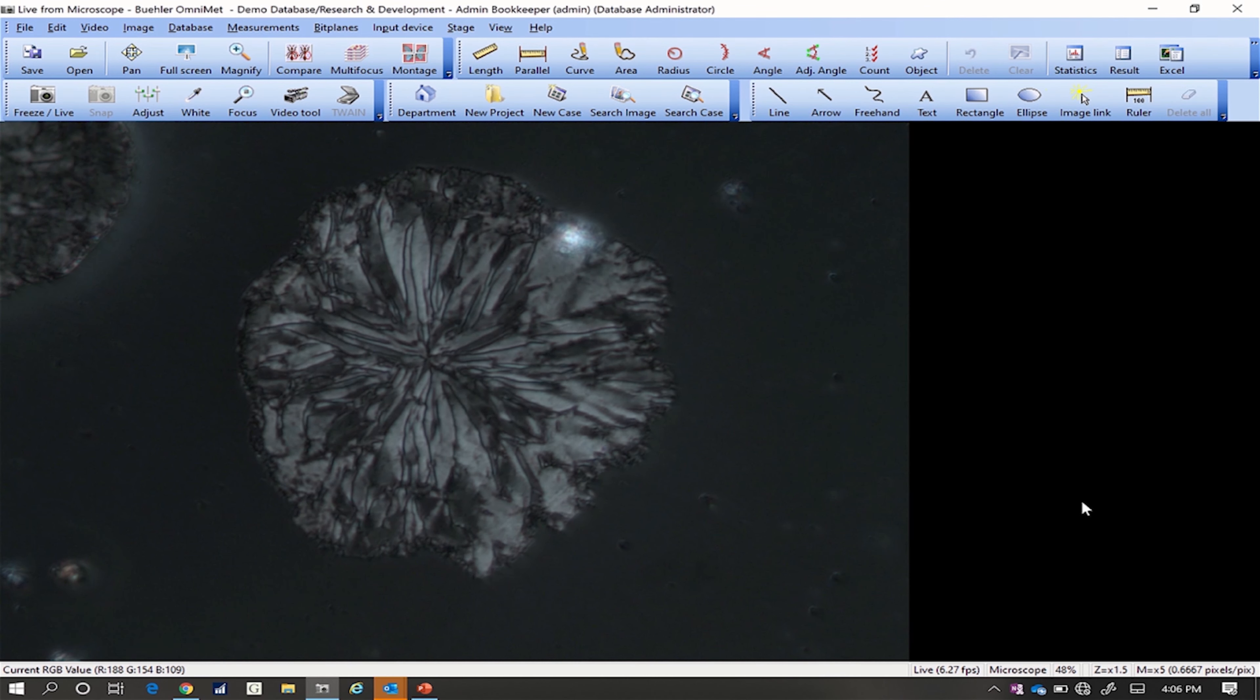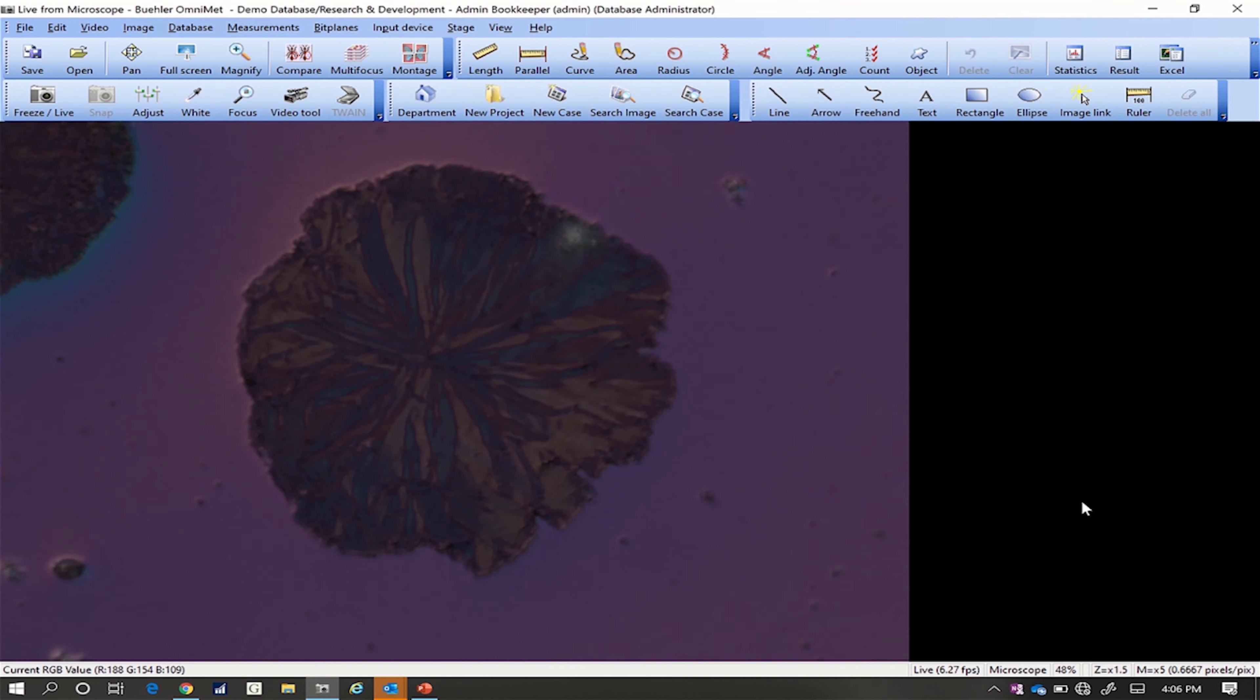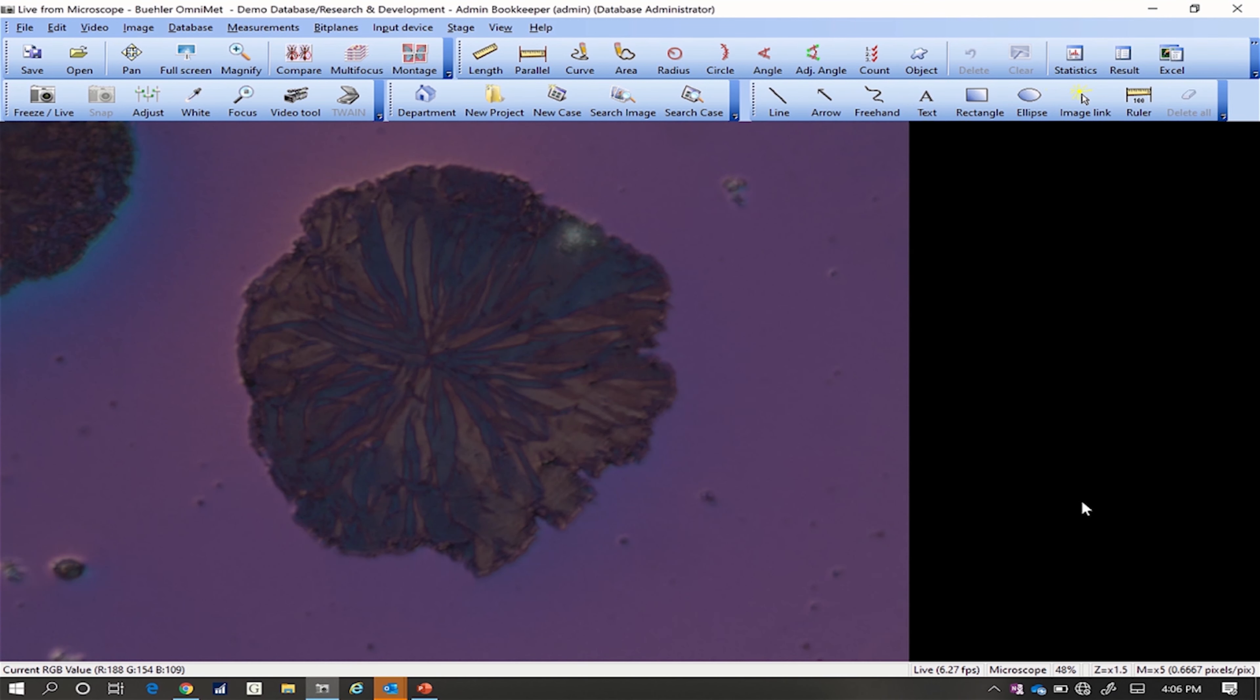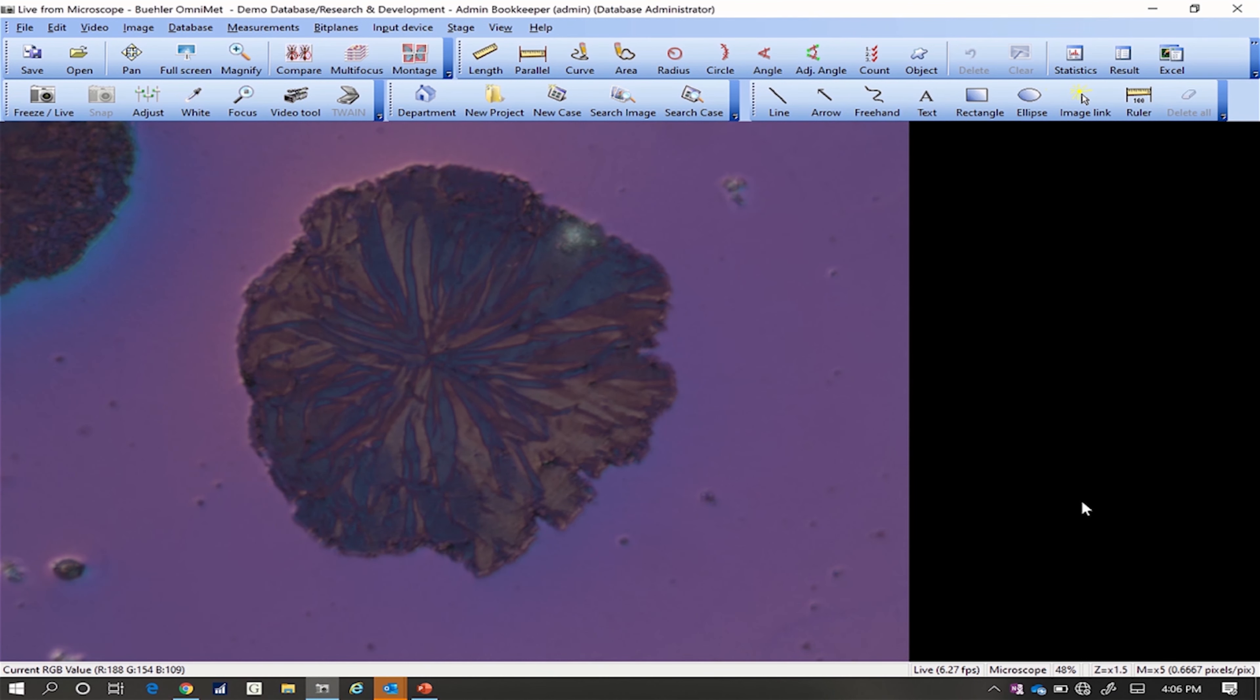To demonstrate on this spirato graphite sample, we will first put in cross-polarizers to show that the color balance works at different lighting levels. We can also go straight to differential interference contrast and show that we now have excellent color representation, resolution, and contrast.